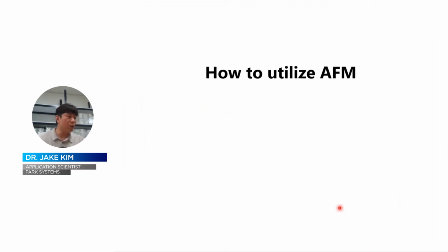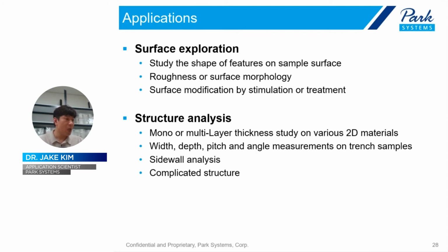Next, let's move on to how to utilize AFM for your research. The first thing is to investigate the surface topography. Sometimes low features, sometimes comparison between before and after some treatment.